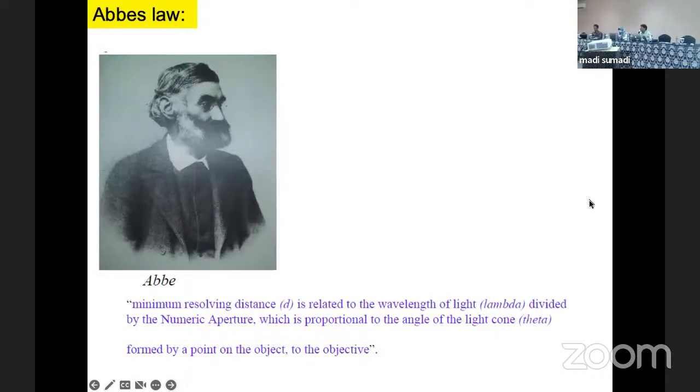A German scientist, Abbe, of Abbe's Law, from the Jena University, where we still see a nice statue, proposed a nice hypothesis about using visible light as a source to see objects. Abbe's Law says that beyond the length of visible light, you cannot differentiate two objects that are less than 350 nanometers apart. So we use visible light as a source to distinguish particles between 350 and 700 nanometers. This is what Abbe's Law says. But this is exactly why super resolution microscopy got a Nobel Prize: with the same light source we use, we can still see objects smaller than 350 nanometers.